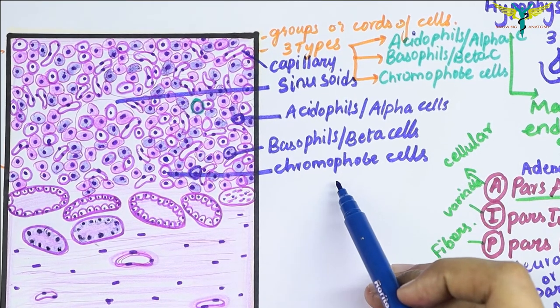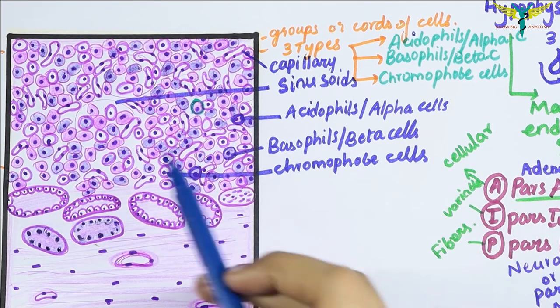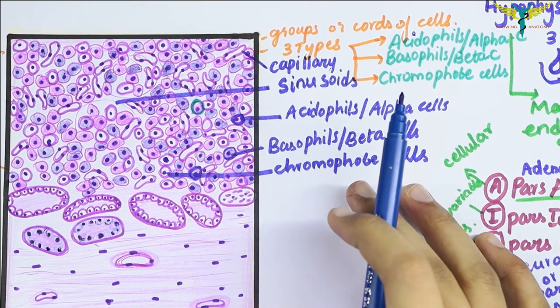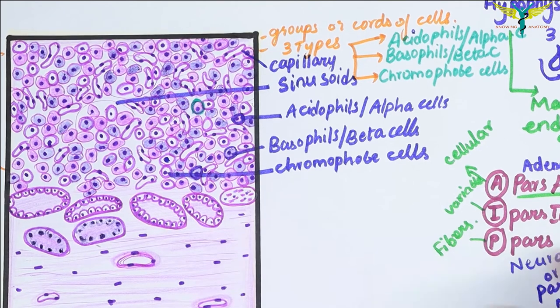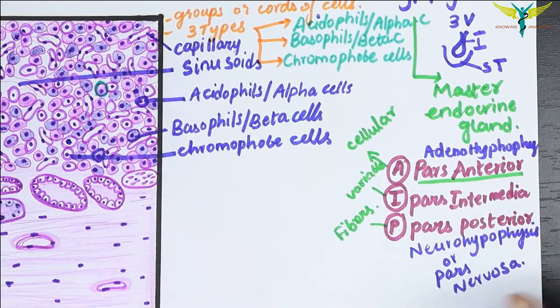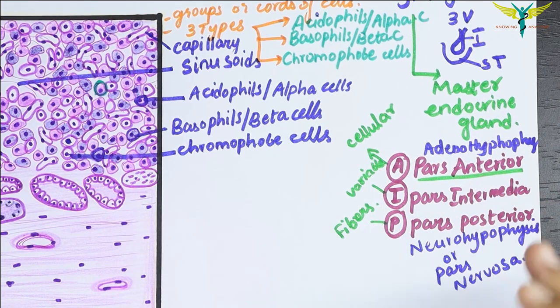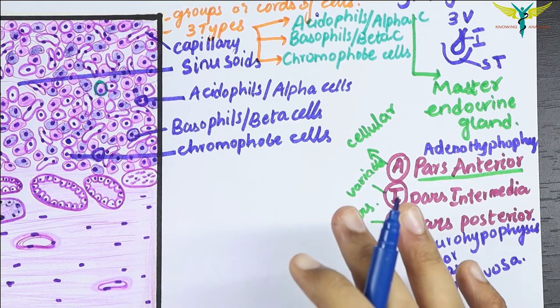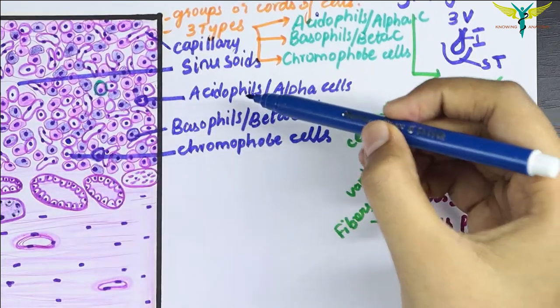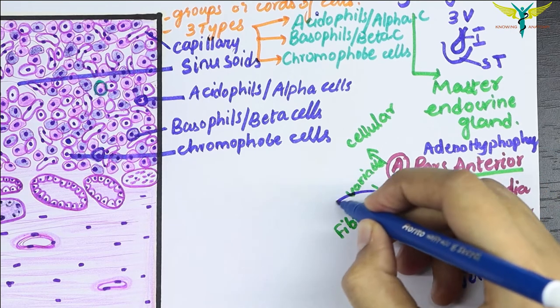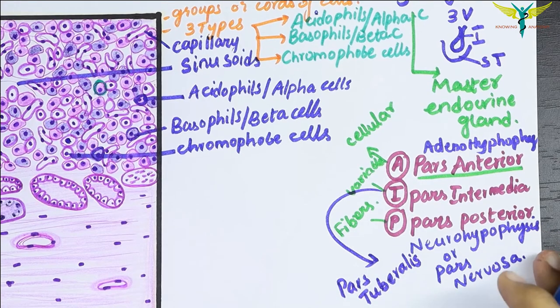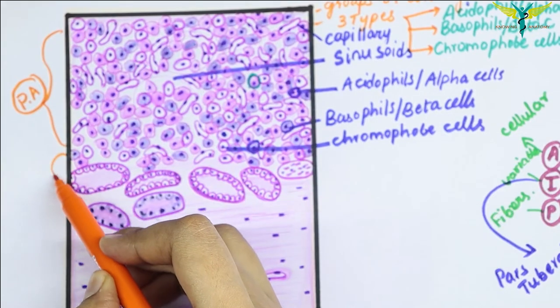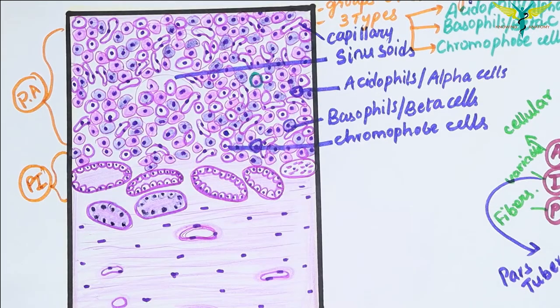The chromophobe cells, the third type of cells of the pituitary gland, do not stain darkly and contain very few granules in the cytoplasm. There is also a pars tuberalis, which is not much studied as it consists of many undifferentiated cells — some are acidophil cells and some are basophil cells.